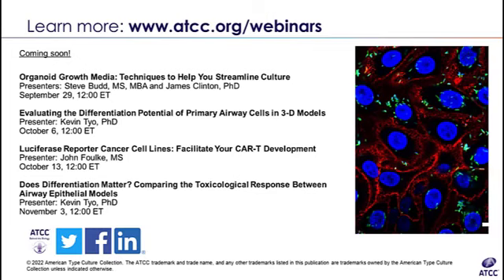Okay, so starting with the least amount of time, like taking out flasks to do media changes or passaging, things like that, I can't see that having any significant effect on the cells. It's common practice. You don't work with cells inside the incubator.